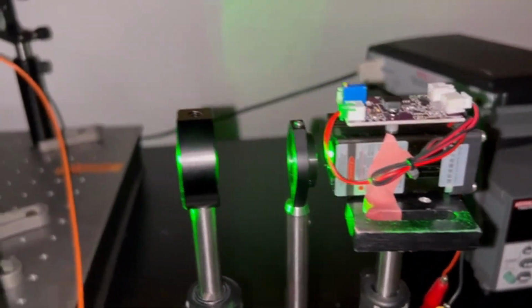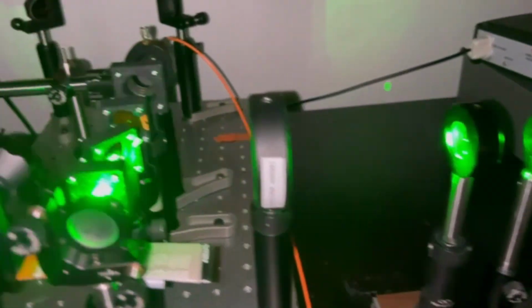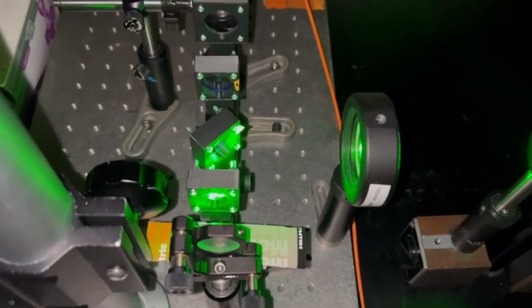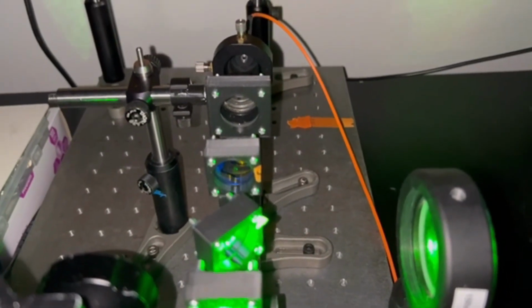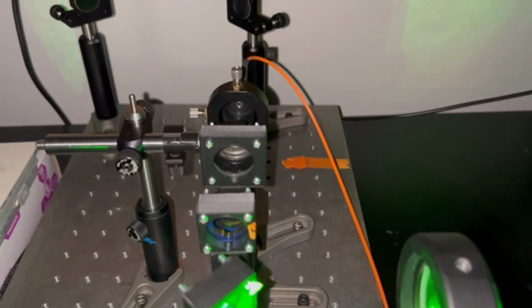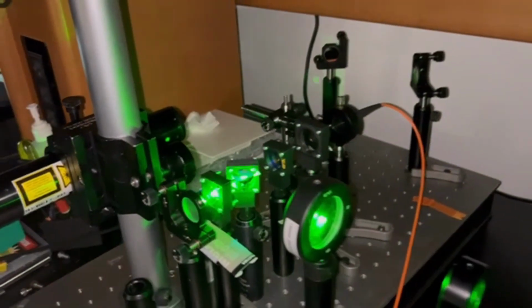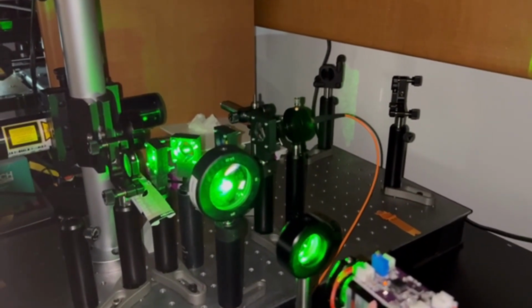After the laser is turned on via user input on the LCD, it is passed through a bandpass filter and then a beam expander setup to clean and enlarge the beam. This beam then hits the 45-degree dichroic mirror and is reflected onto an 18mm focusing lens to create a tight focus on the sample. Any Raman scattering that occurs is recollimated by the focusing lens, passed through the dichroic mirror, then isolated by a long-pass filter. A 75mm focal length lens couples the signal into an optical fiber for the Blue Wave miniature spectrometer. In the final system, our custom-built spectrometer will take the place of this fiber.